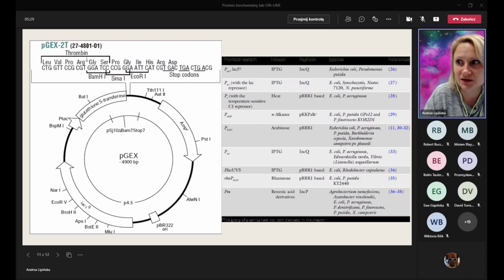Okay, so production of a new protein, if you want to express a gene and produce a protein, this is always a biological question. Will it work? How will it go? You always have to check it first experimentally. You have to check the solubility of your protein, like we will also be doing this week. So we were testing the solubility of our GST fusion protein, and you will see that it's partially soluble. It's not 100% soluble. If you want a protein which is 100% soluble, this will be GST only. If you want pure GST, this is really soluble.